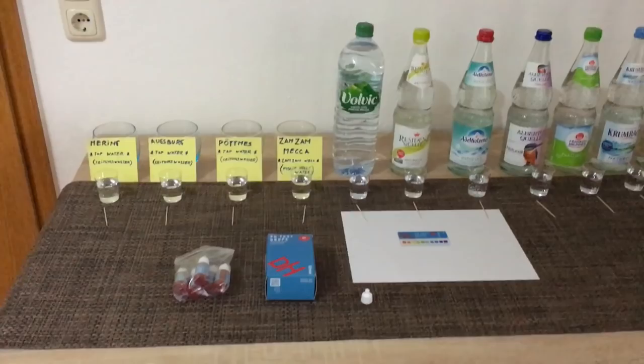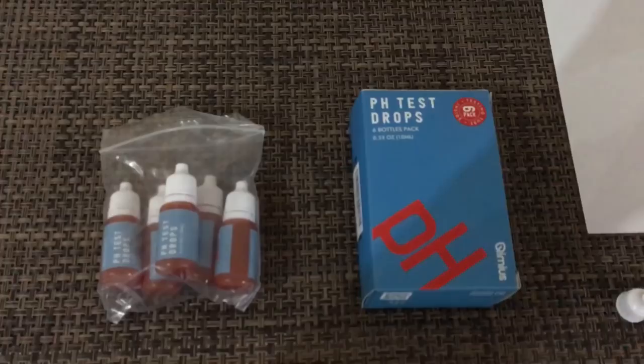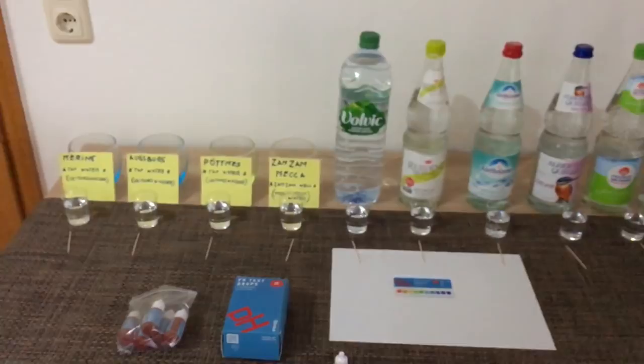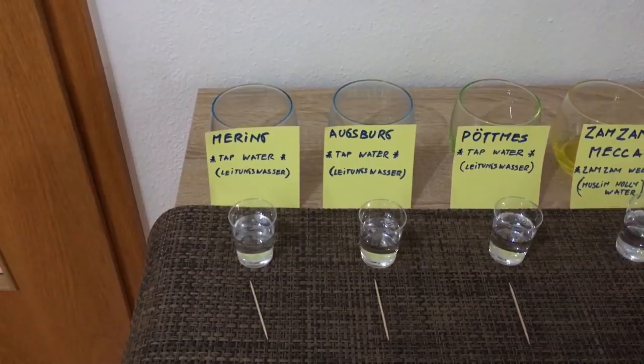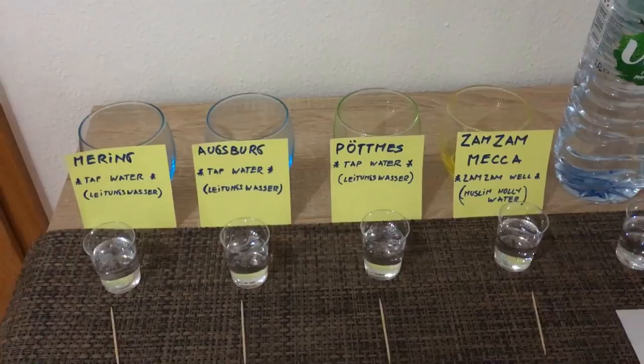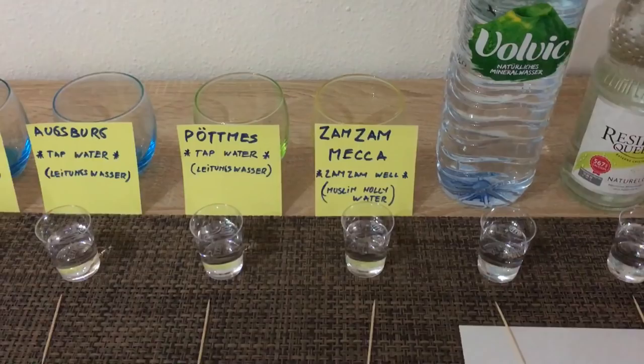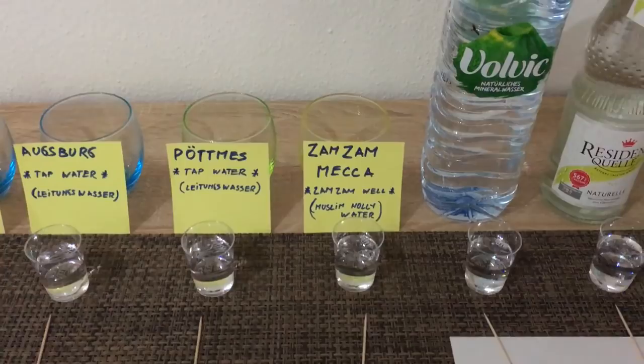I've seen a lot of YouTube videos on pH level testing, so I went ahead and ordered one of these test kits on Amazon — should be pretty interesting. What I did is I got some tap water from a local tap here, then from the closest neighboring city, Augsburg, then from another small place approximately 40 kilometers north, and then the holy water itself — Zamzam from Mecca. I received this water two weeks ago and I am very interested in testing it out; it tastes absolutely amazing.